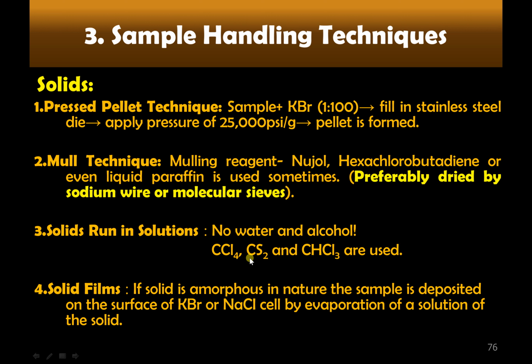In solid films, if a solid is amorphous in nature, the sample is deposited on the surface of KBr or NaCl cell by evaporation of a solution of the solid. So this is another technique.